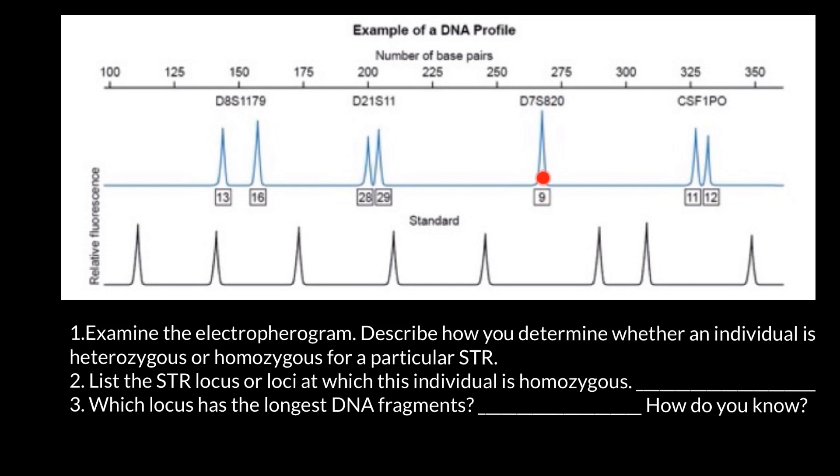That means that actually on both chromosomes we have the same size alleles. That's why we have a spike here that is greater than in the other loci. Now you see this reference ladder and here are the sizes of these alleles. Each spike represents an allele.